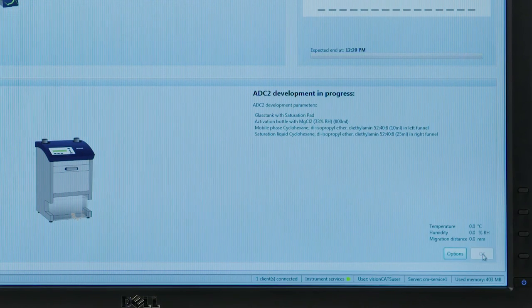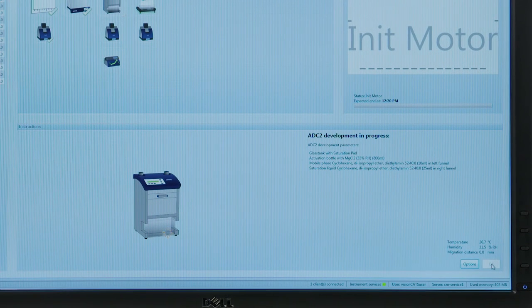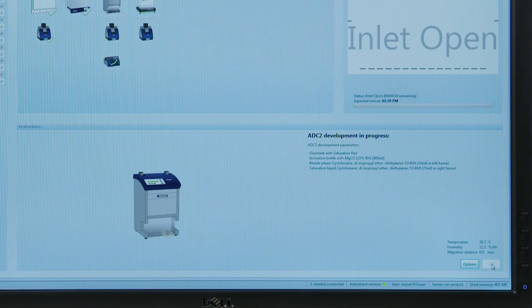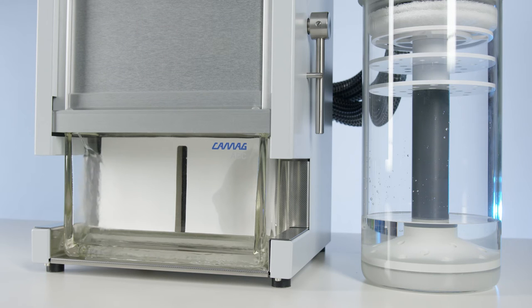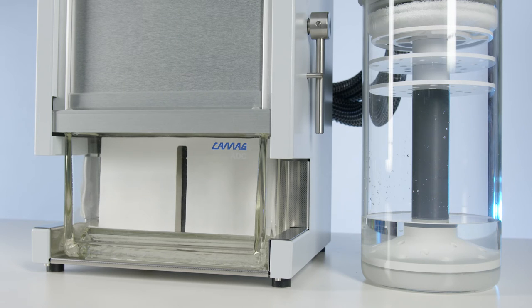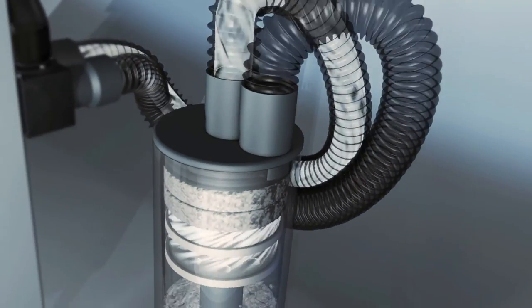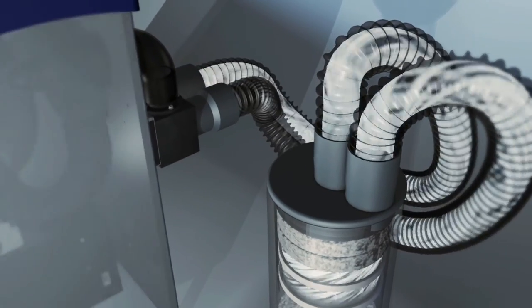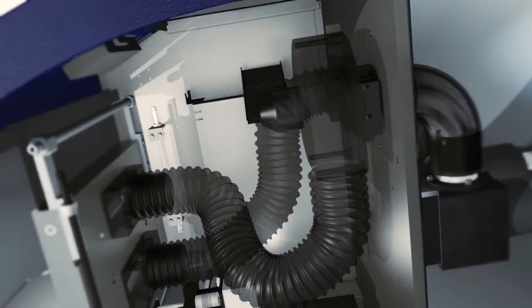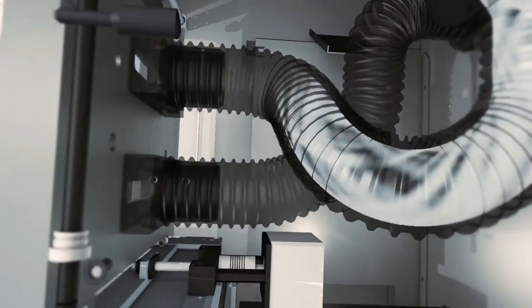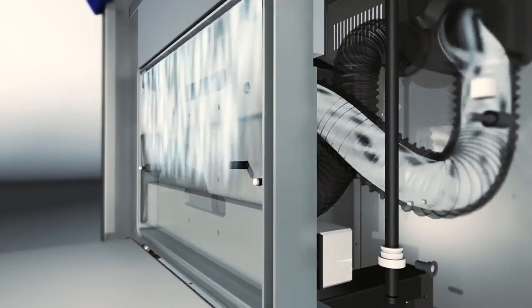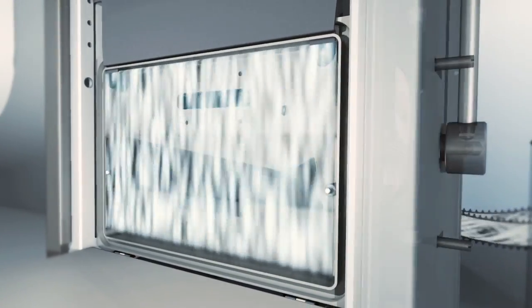The entire process is monitored. The plate is developed in a saturated chamber if using the default settings. The automatic developing chamber ADC2 and the optional humidity control create standardized conditions, obtaining reproducible results from plate to plate. Perform chromatography under different climatic conditions and compare chromatograms created in different labs or results obtained from different batches.